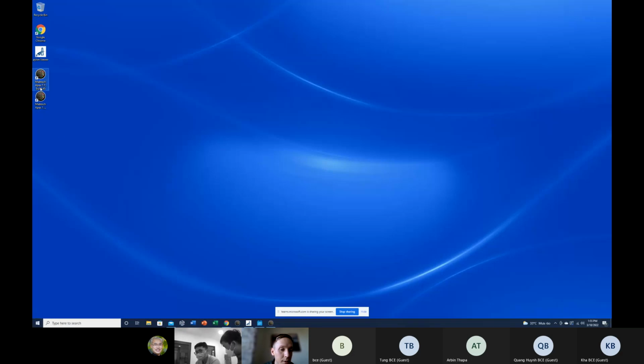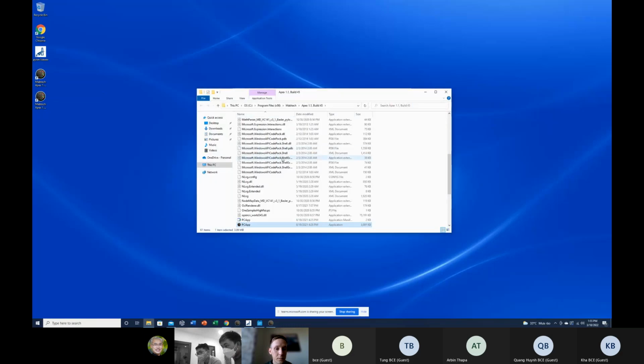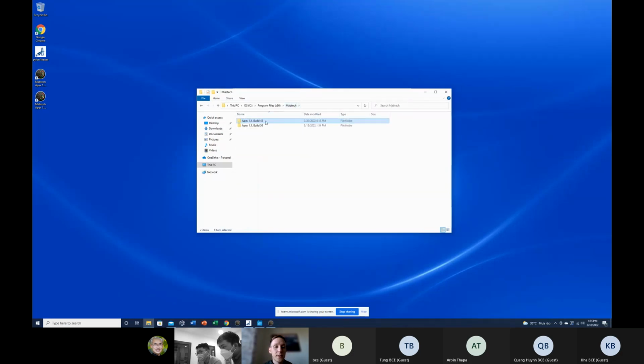So we uninstall this version, right? Exactly. You can uninstall that version. The 145 can be uninstalled. Okay. But it's actually enough to just drag it to the recycle bin and then just empty it. So, yeah, exactly. Okay. Good. So then we have this latest software version.